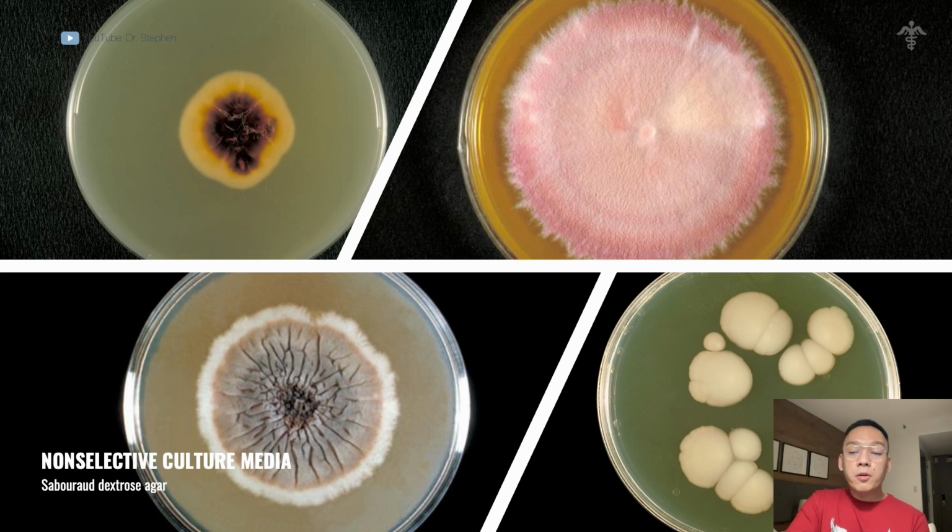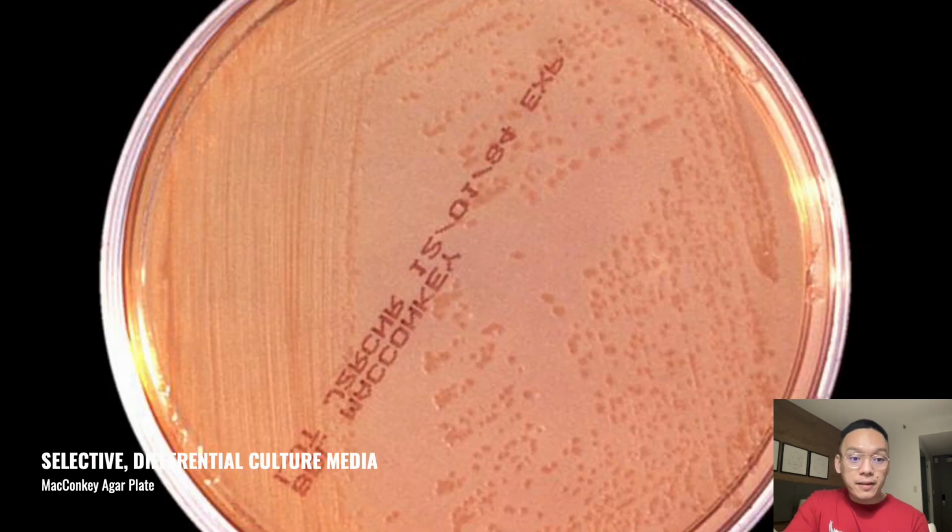This can also grow filamentous bacteria such as Nocardia. It is highly utilized for research and clinical care.